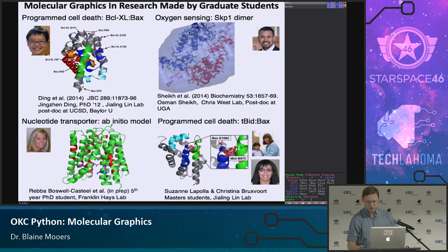This is an image of a protein. There's two copies of it. It's enclosed in a SAXS envelope, a low-resolution molecular envelope. SAXS is a technique in which you can obtain the overall shape of a protein without crystals. You can get this from the protein when it's free in solution. And so you get a 12 to 20 angstrom resolution molecular envelope shown in gray.